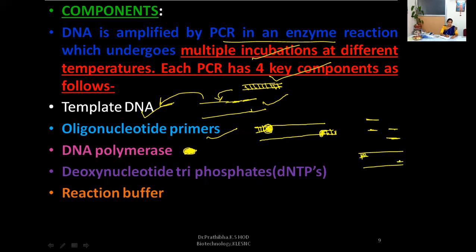Once the primer is attached, the DNA polymerase goes and sits and starts synthesizing individual nucleotides according to the template DNA. According to the template DNA, it will keep on adding the individual nucleotides.